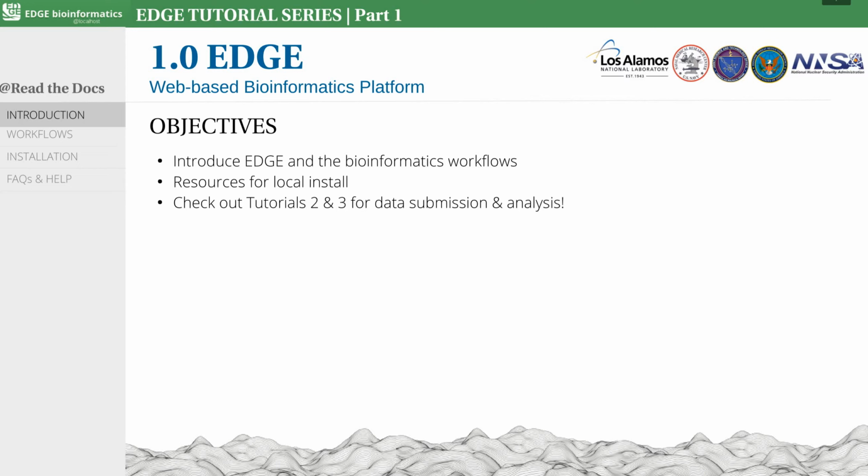In this video, I'm going to introduce the EDGE Bioinformatics platform and give an idea about the workflows EDGE has to offer its users. I will also briefly go over the recommended computational environment and note resources necessary for advanced users that wish to install EDGE locally. We've made parts 2 and 3 of this series for a detailed walkthrough of job submission and data analysis. I encourage you to check those out after you watch this video.